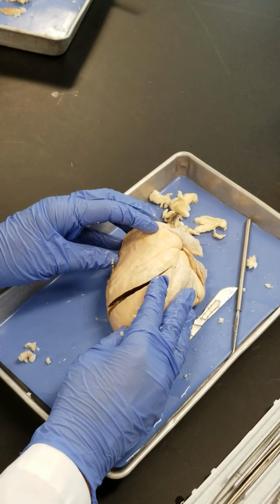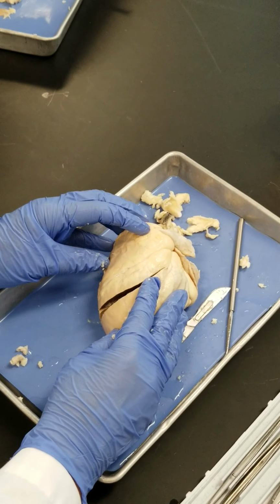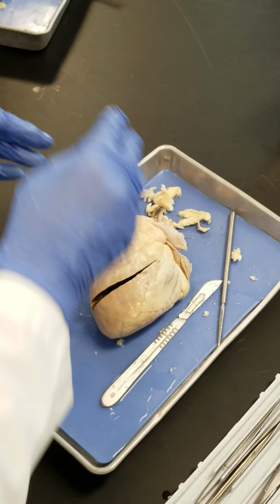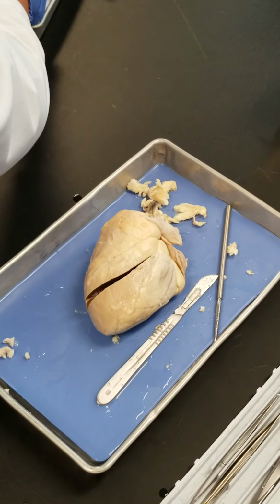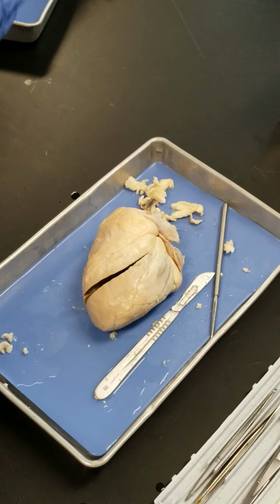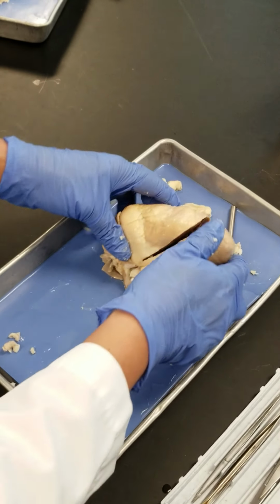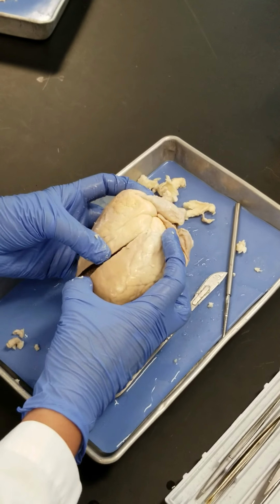Yep. So you finished? Everybody has done? Yeah? I'm just going straight over here, and then there was another one. What's the question? Is this a good place to cut it? That's okay, nothing is wrong. You can do it anyway, right? So you just can continue over there and continue the same way, just the same way, parallel to the anterior ones. Go away, right? Like this. You don't have to turn it around and continue with the posterior interventricular sulcus. Just go like this. Yeah, I had to work hard with all this fat on.